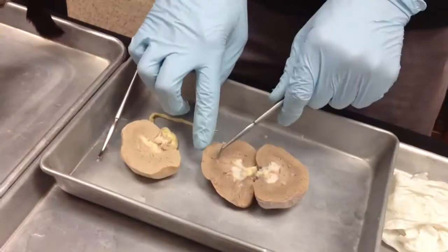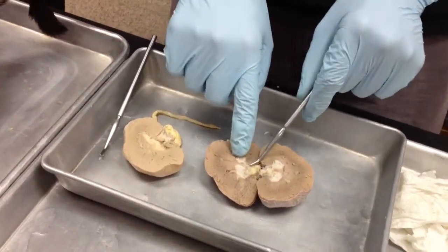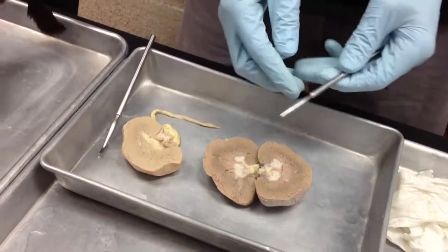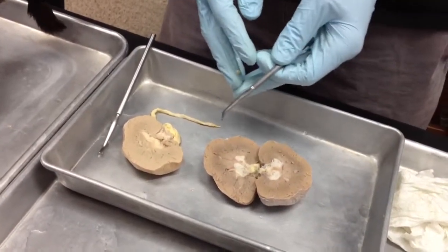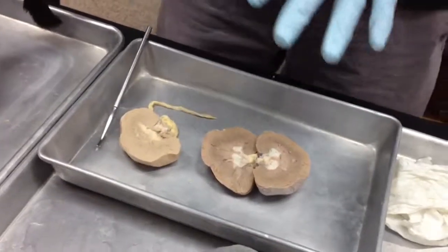So: cortex, blood filtration, urine formation, entering into the pyramids, collecting here, going out to the urinary bladder. So for that, any questions about that?